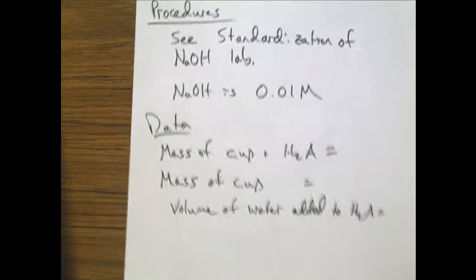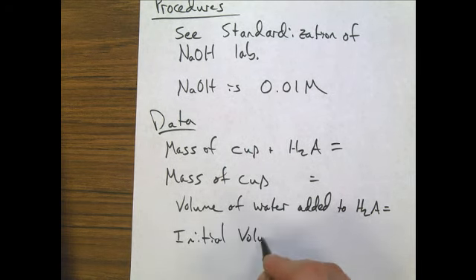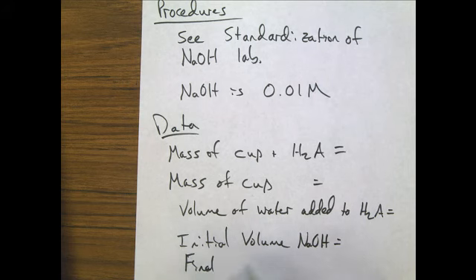The other data that you're going to record is you're going to have the initial volume of NaOH, and then you're going to have your final volume of NaOH. And that will be enough data for you to do the analysis.